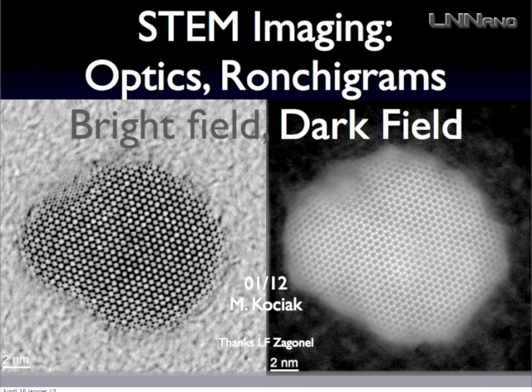Okay. So what I want to talk about this morning, these 2 hours, is scanning transmission electron microscopes. And there are many things you can do with that, but coffee. And so it will be just the basics of it. I will focus on optics, how you send electrons on your sample and what you do with it. On Ronchigrams.